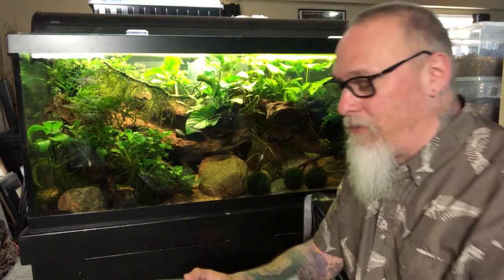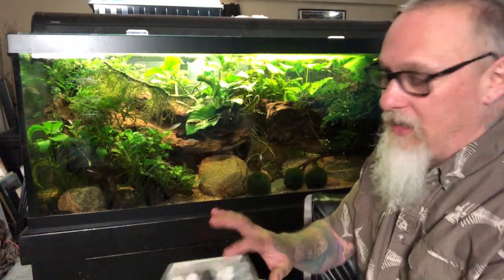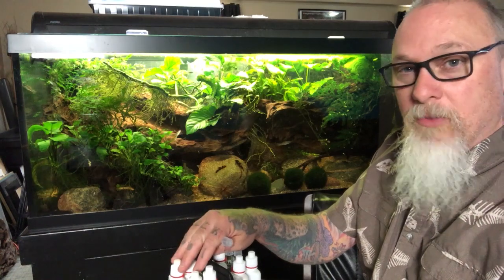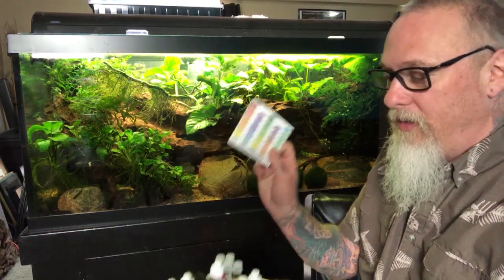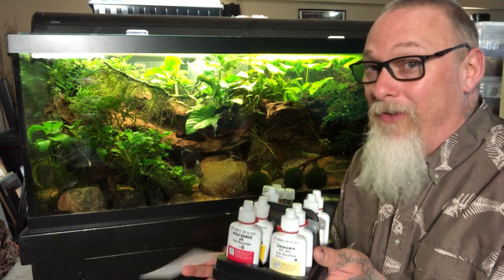As mentioned, there's the little test strips, and then there are all sorts of different types of test kits available that come in different forms — both readily available to most hobbyists globally. These are the ones where you take some water into a little vial, add whatever agents are required depending on what you want to test for, and then compare the results to different color charts. The real key is that these are not lab grade products — not designed to give you absolute pinpoint accuracy to the hundredth degree. We don't need that for most aquarium purposes. For any average freshwater or even saltwater aquarium, these basic test kits are honestly all you're ever going to need.